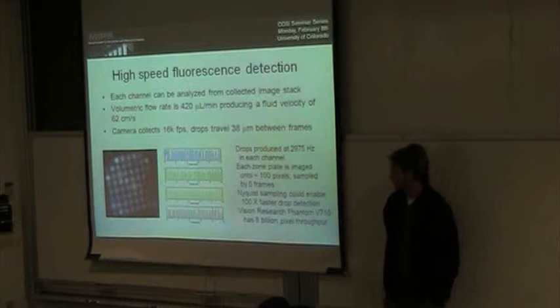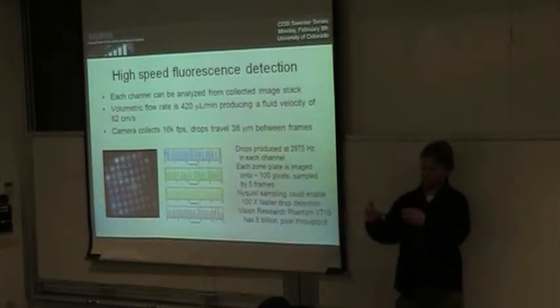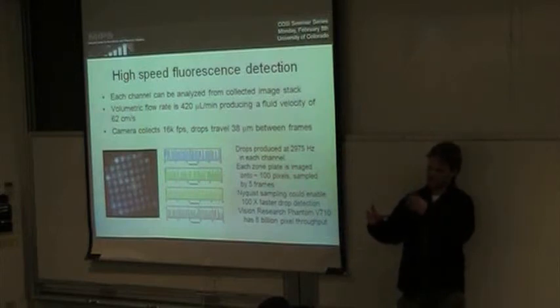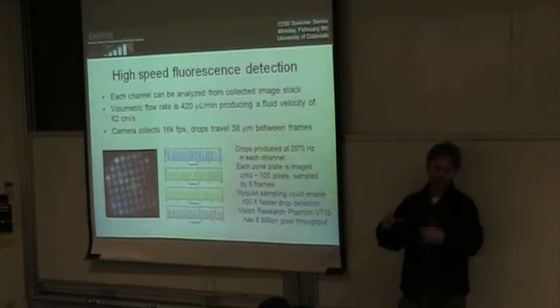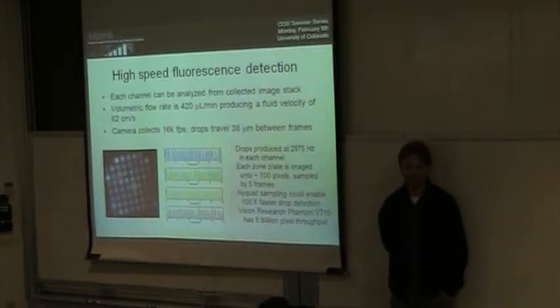I was kind of hoping to do something like that, a single zone plate, but naively, the first design is if you have a single zone plate creating many spots, and imagine a point source occurs in one of those spots, I didn't know how to figure out if it was occurring in one versus another. You could create many excitation spots very easily with a single zone plate, but figuring out where the light was coming from in collection, I didn't know how to solve that.